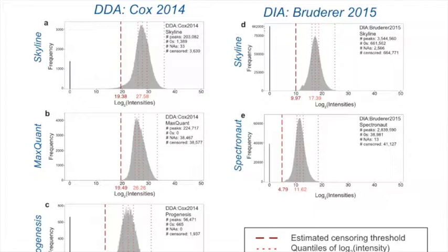But it's true that, for example, Progenesis actually has 0 NAs, so all zeros. But you have others, for example Spectronaut, which has 13 NAs and 38,000 zeros. For Spectronaut, I think it may just be an artifact of how the output is structured.